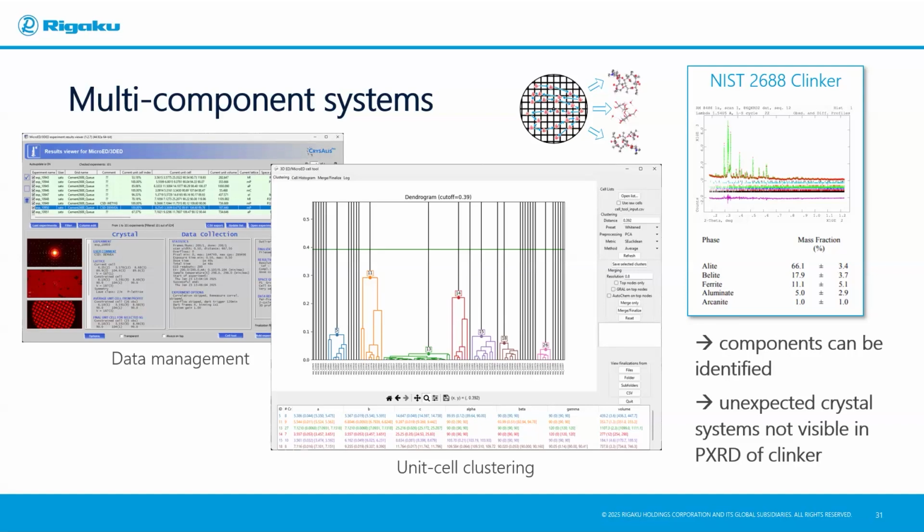So it depends. Typically, if the instrument is freshly aligned, you should not have to do this in too many steps. Usually, the algorithm will rotate over the full range, and then you can ask it to set the limits automatically based on this.